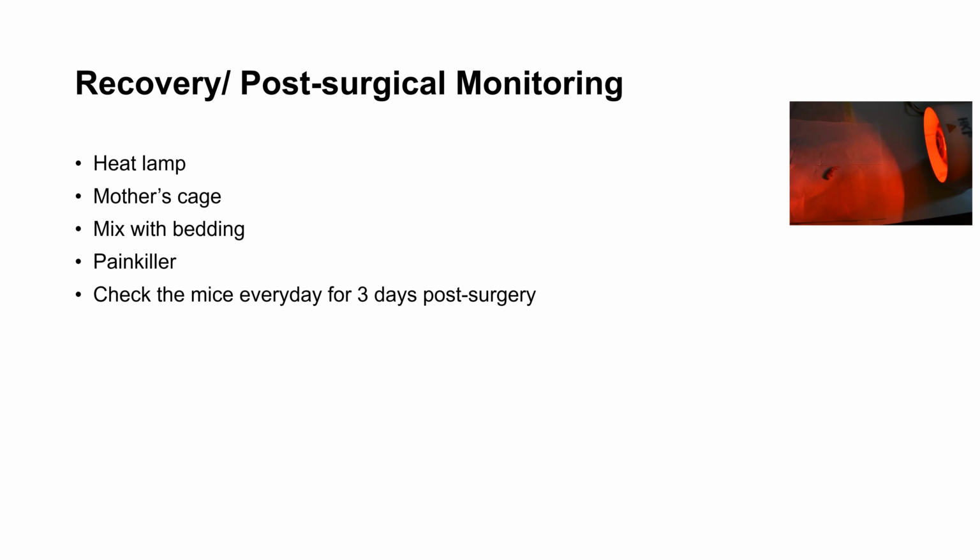If it is not the case, you might think of providing a foster mother. And ensure that the mother has access to free water and food with enough nutritional value.